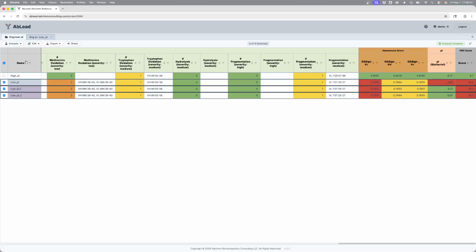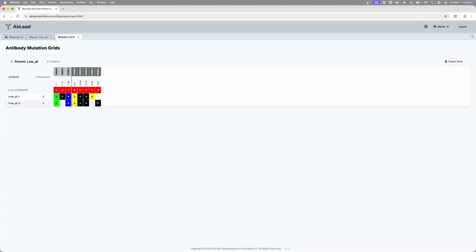I would, of course, look at these mutagenesis positions that were made and see where they are and see if I thought they were going to impact efficacy before I made them. But the PI of a molecule can be shifted, and this tool helps to track that.